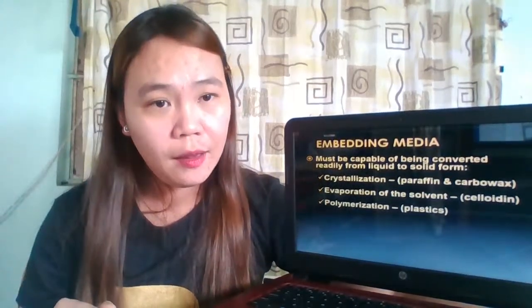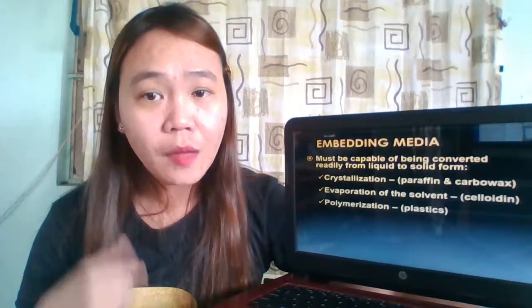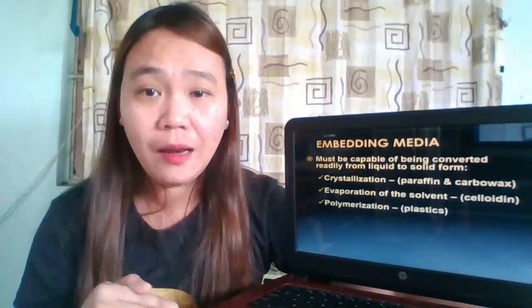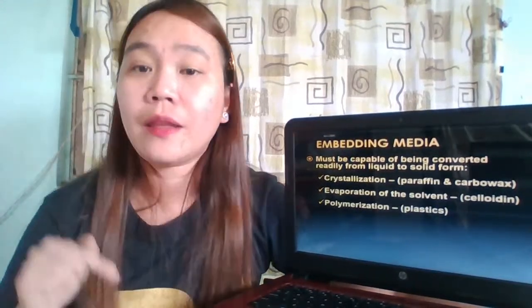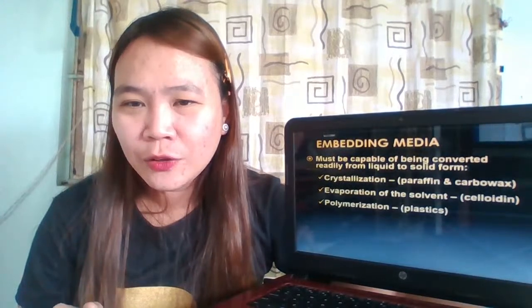That's why your embedding medium has to be liquid for infiltration, converted to solid during the embedding process.